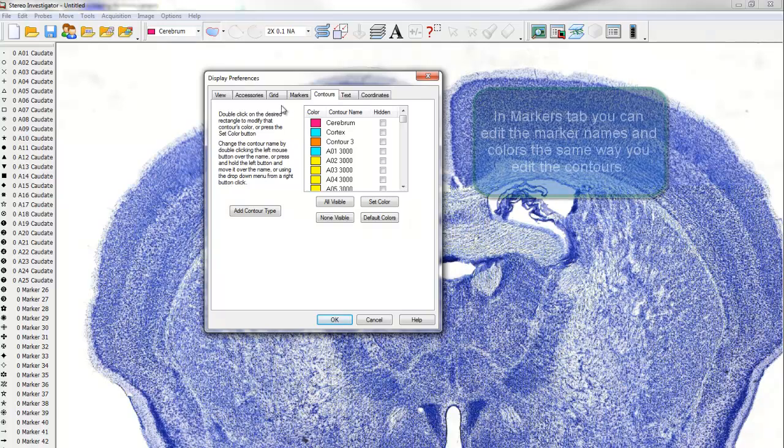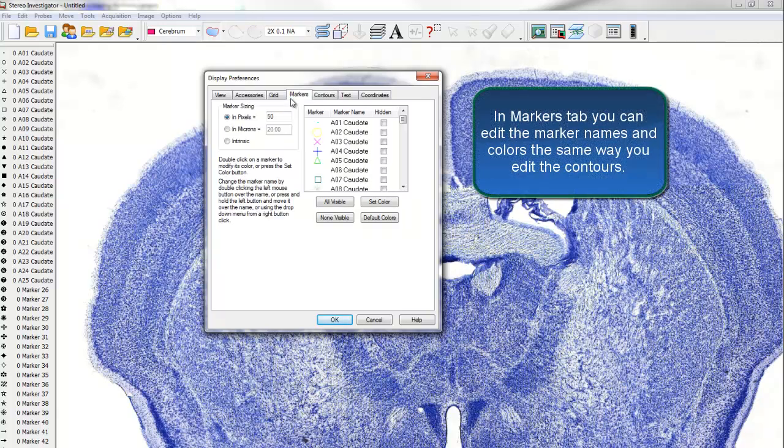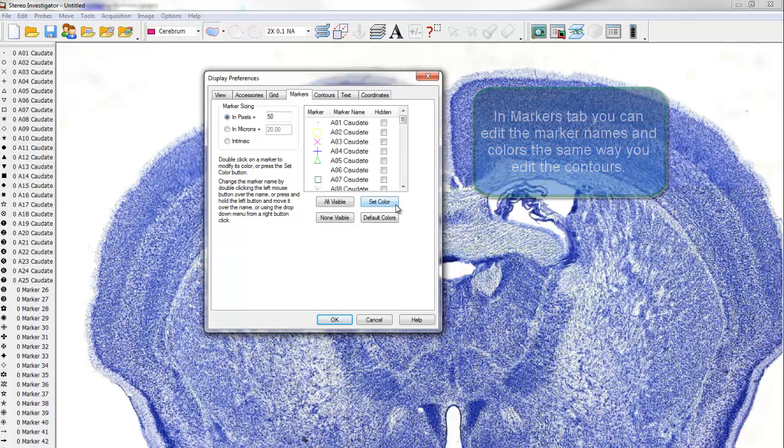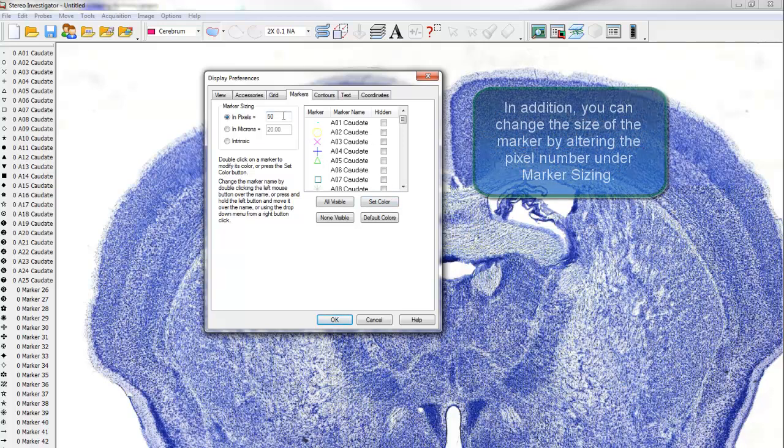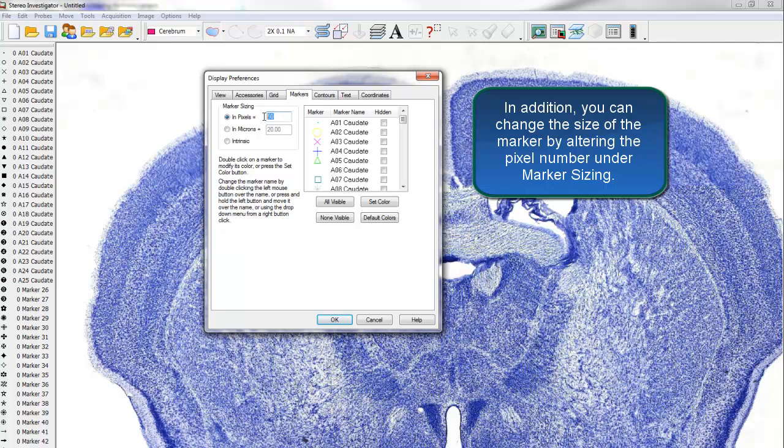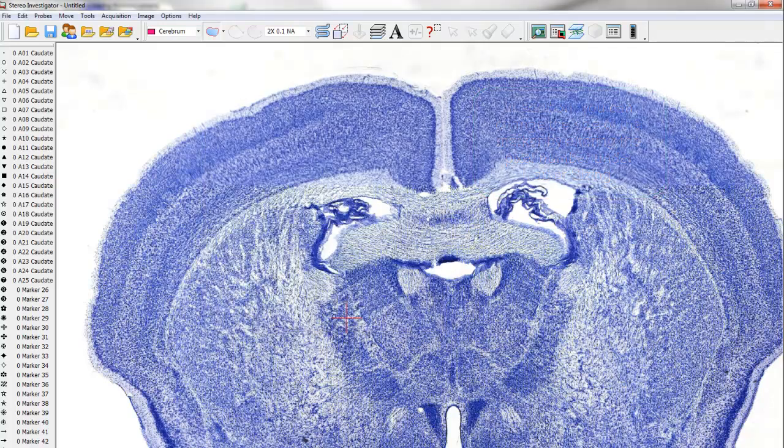Under the Markers tab, you can edit the marker names and colors in the same way you edit the contours. In addition, you can change the size of the marker by altering the pixel number under Marker Sizing. Click OK when you are finished.